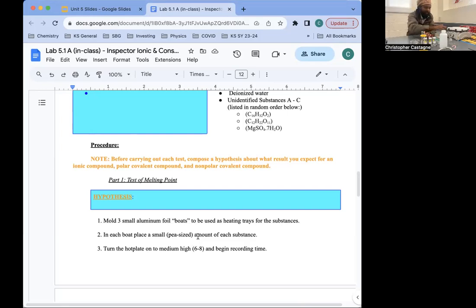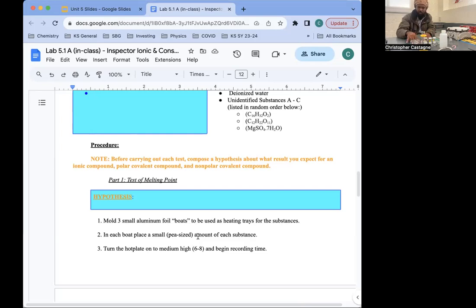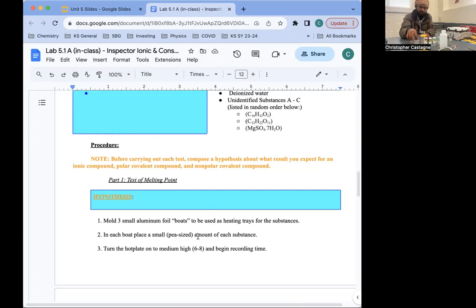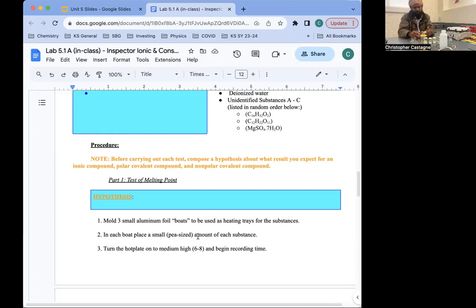We're going to try to make the three pieces of aluminum identically folded. The easy way is to use one of the small beakers — put it in the center, pull the aluminum up the side, and you get a nice flat base. You want that flat base so that you can get good conduction between the hot plate and the foil. By using the same beaker, you're going to get the same exact size and shape.